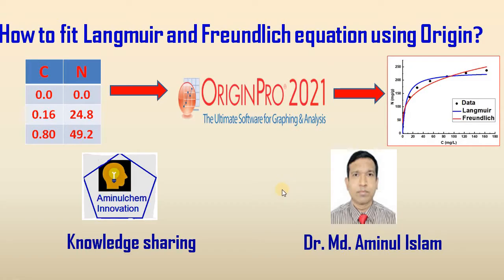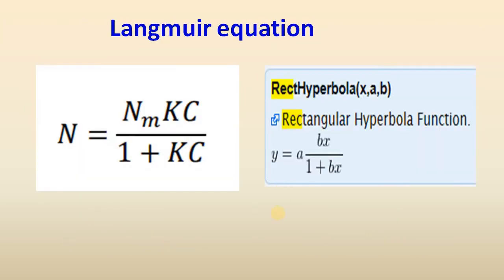In order to fit the Langmuir and Freundlich equations, we first need to know what the Langmuir equation is. The Langmuir equation was originally used for adsorption of gas onto a solid surface. Now it is used for gas-solid and liquid-solid systems. The Langmuir equation considers the formation of a monolayer onto a homogeneous surface.